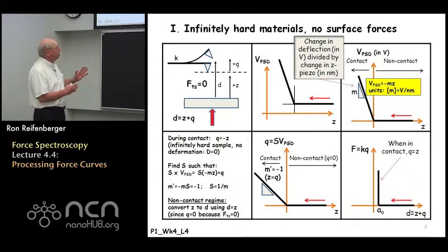Basically what it shows is that the interaction force is 0 all the way up to this arbitrary parameter A0, which is again on the order of 0.3 nanometers. Once the tip and the substrate are separated by this distance A0, then as you continue to load the substrate against the tip, all that happens is there's a hard wall interaction force that goes vertically upwards, okay?